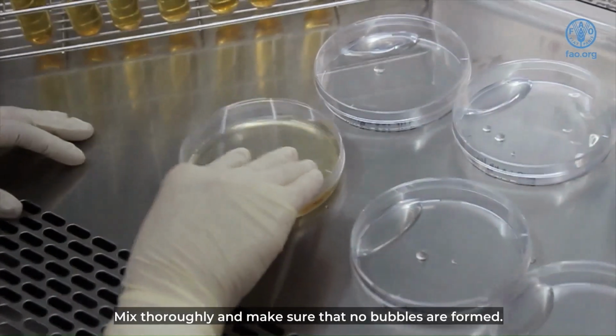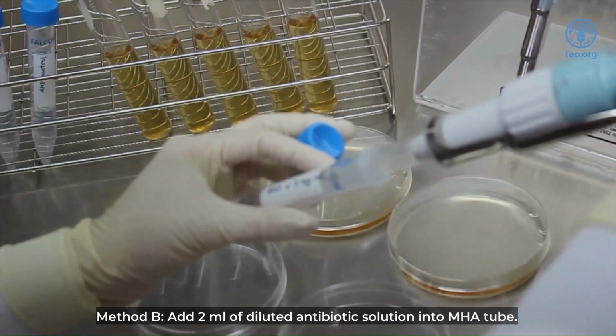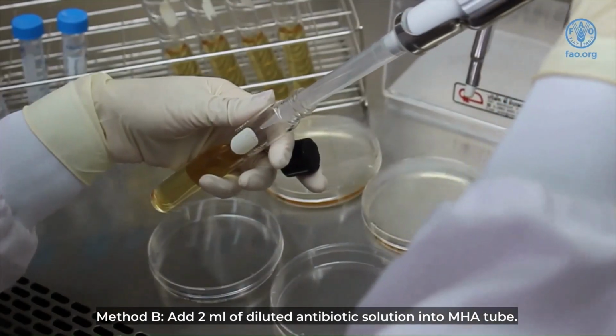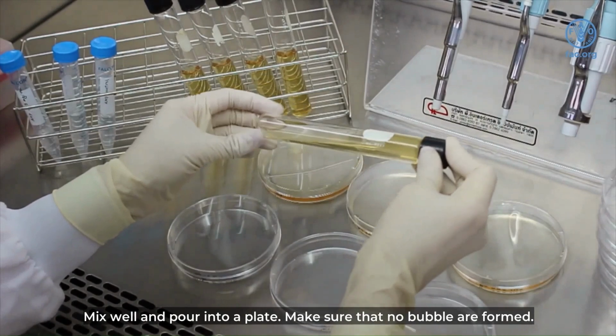Mix thoroughly and make sure that no bubbles are formed. Method B. Add 2 ml of diluted antibiotic solution into MHA tube. Mix well and pour into a plate. Make sure that no bubbles are formed.